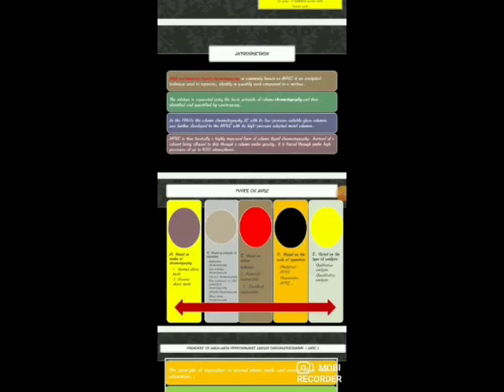So mainly the silica gel is converted into ODS silica gel by treating it with these chemicals. So this is converted into a non-polar nature, because silica gel is responsible for polar nature and ODS is responsible for non-polar nature.